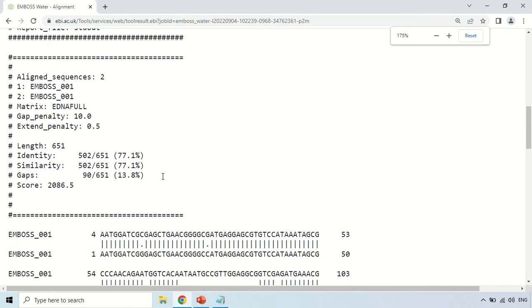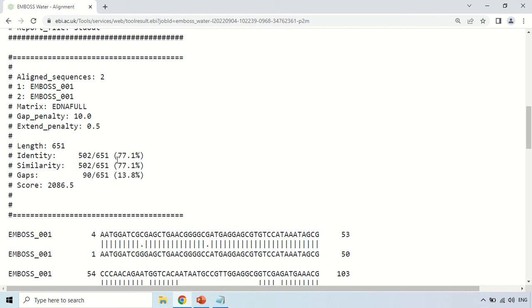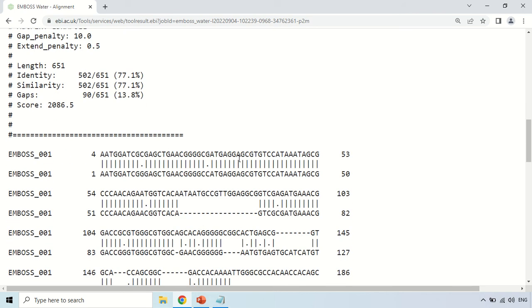This shows the length of the sequences. The identity between these two sequences is 77.1%, and this is the similarity value. This is the main result of the alignment.